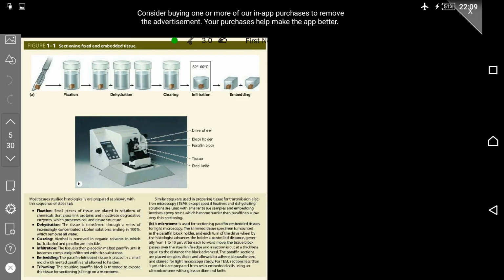Yeah. So the whole process of preparation starts from taking the sample, as is shown in this portion, and after taking the sample or cutting by a scalpel, it goes to another process called fixation. Fixation literally means to fix something, to put something in a fixed position so that it doesn't change. And that is exactly what happens in here.